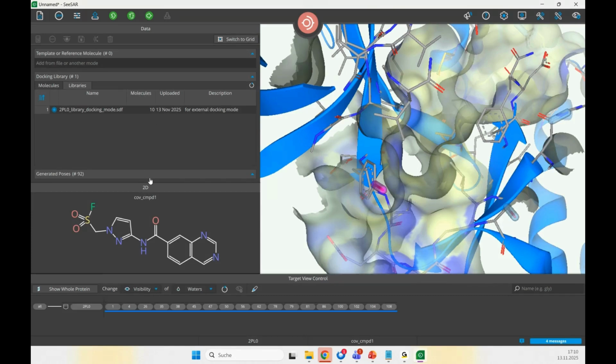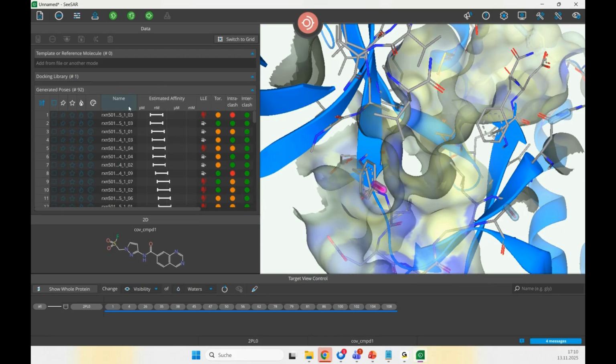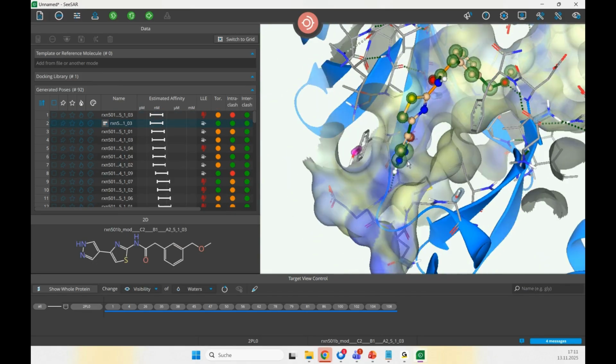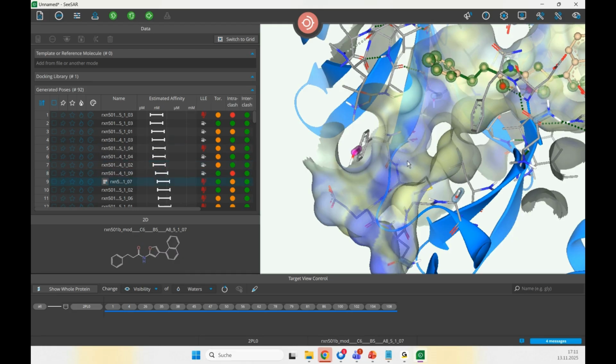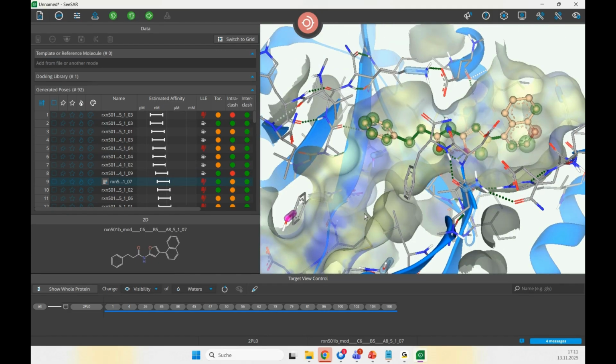And I can click through them and see what the results are. So obviously, it takes some time to work with a larger set of compounds. So therefore, we have taken this into consideration, how we can make it more sophisticated, because here we also include triplings and doublings and so on.